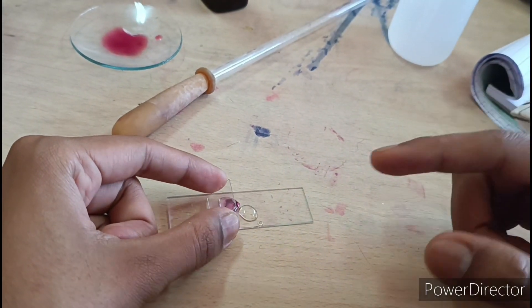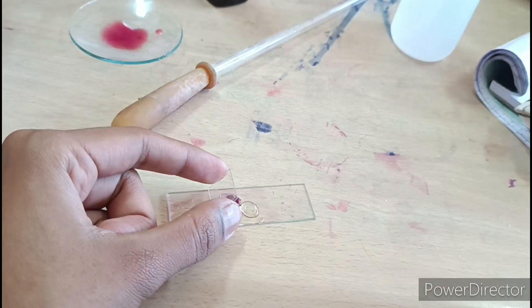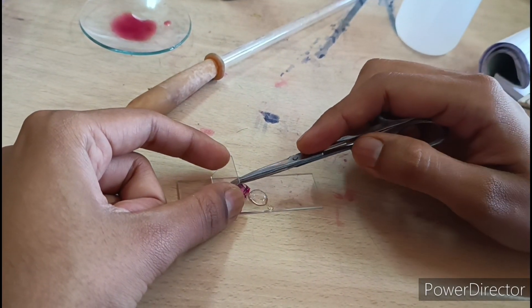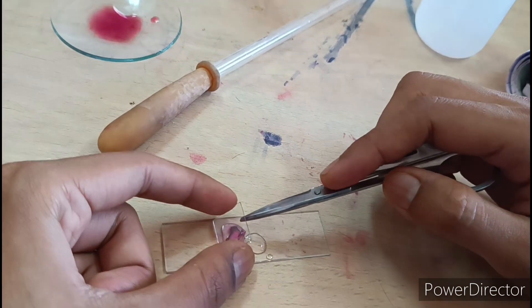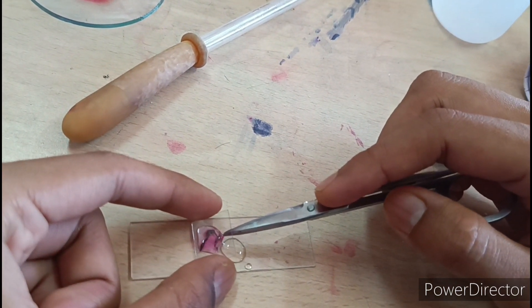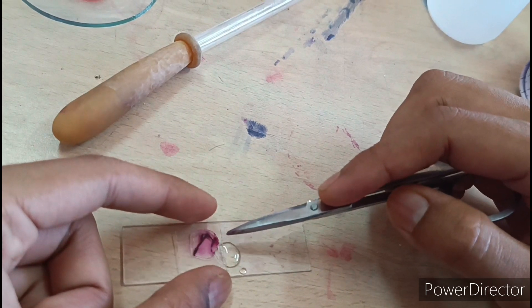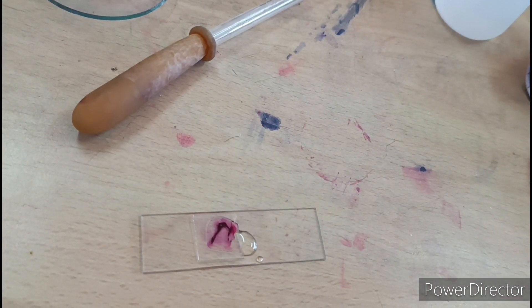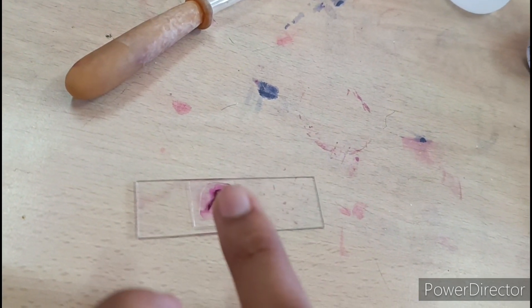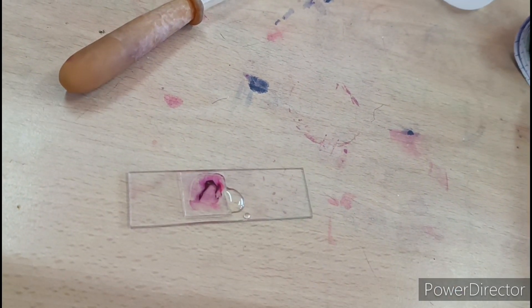We will not make bubbles. This is a cover slip — it will go down slowly. I will put it slowly and slowly so there will not be a bubble. If you put it directly, you will see bubbles.